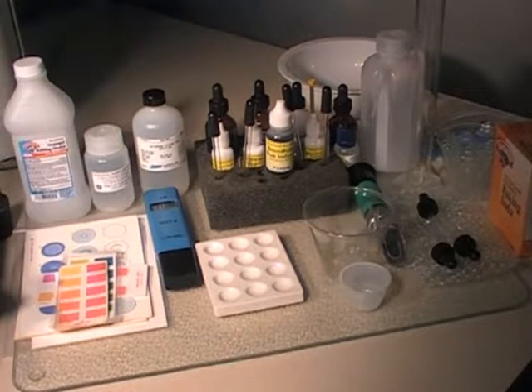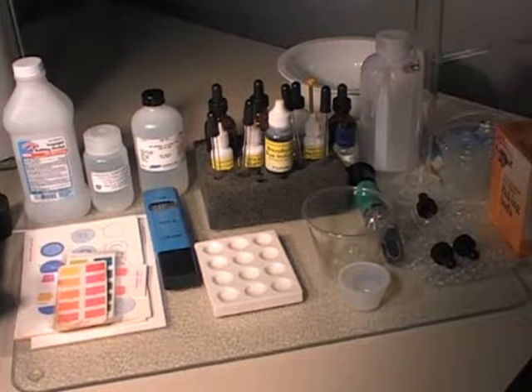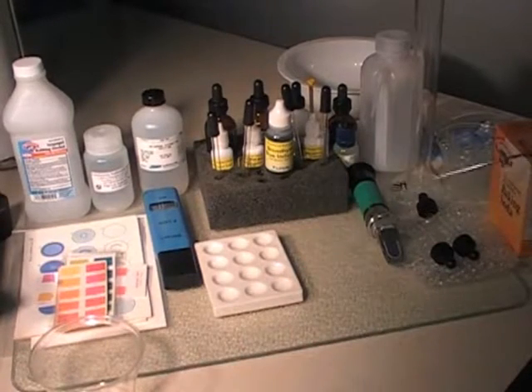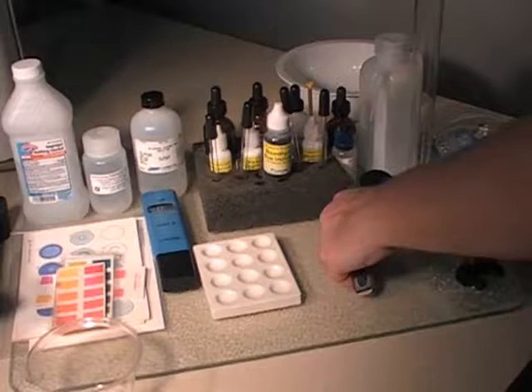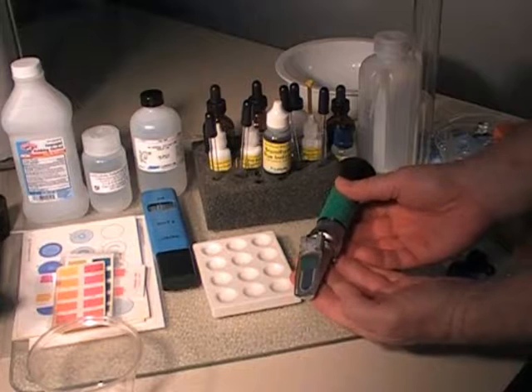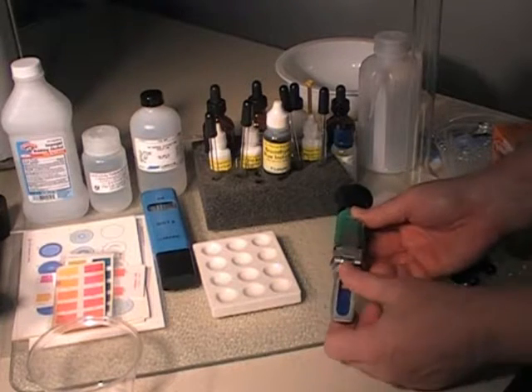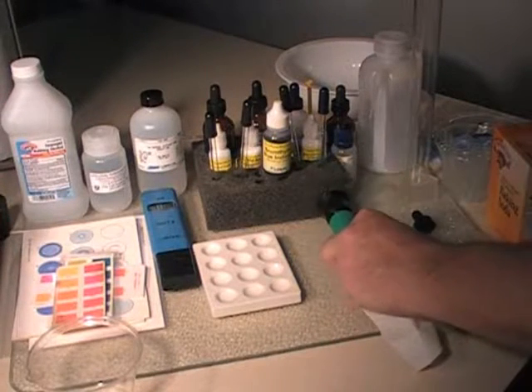Let's get started with the first piece of equipment in the test kit. That piece of equipment is what we call a refractometer. We recommend the VG BTX1 — it's an automatically temperature compensated refractometer, meaning you really don't have to do anything with temperature; it does all that by itself. It's about $110, a very nice refractometer with a very nice visual screen.